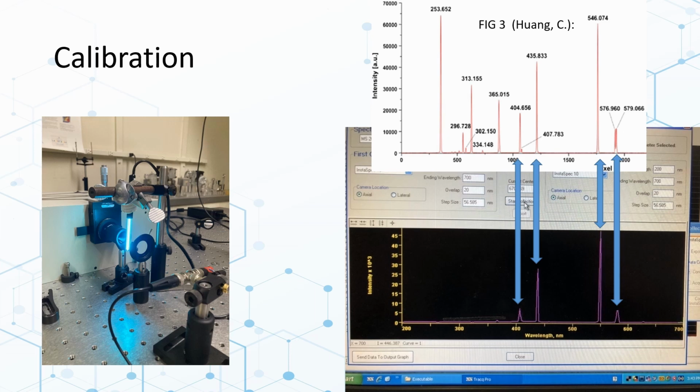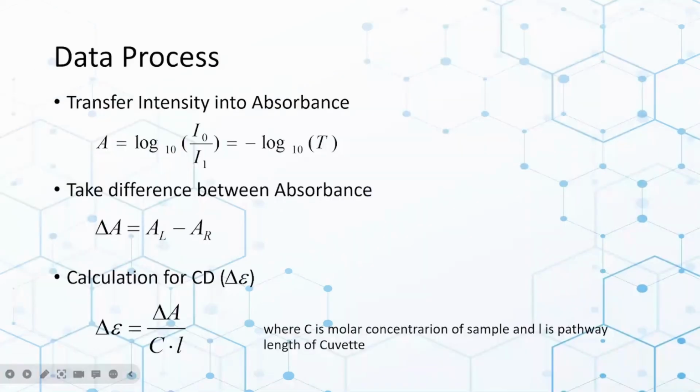As mentioned in the video, we used a mercury-argon lamp to calibrate our system. The lamp provides accurate gas emission lines which can be utilized to verify and calibrate spectrometry wavelengths. These 4 peaks of our graph were indicators that we have successfully calibrated our monochromator and can produce accurate data.